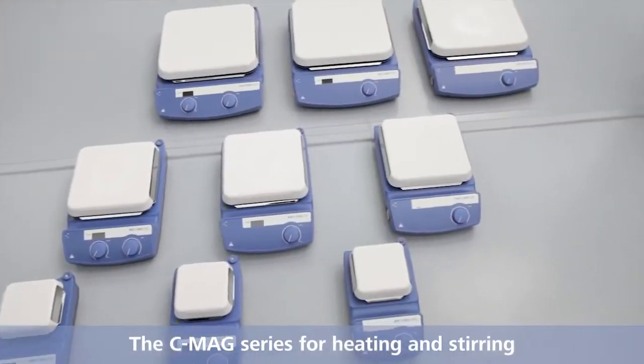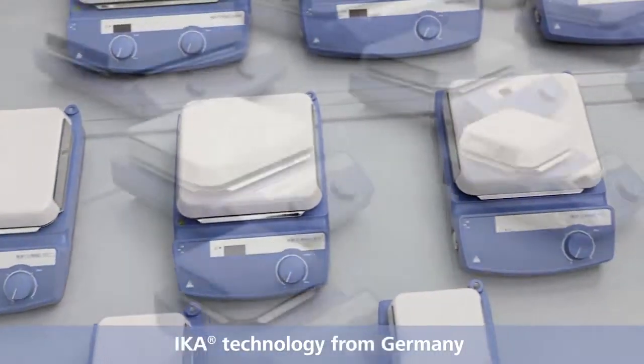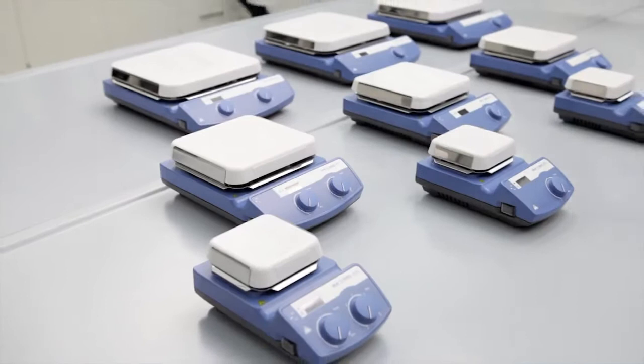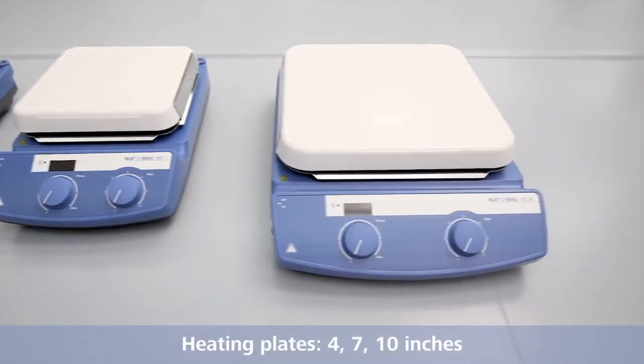The C-MAG series for heating and stirring, IKA, technology from Germany. All devices are available with heating plates of 4, 7 and 10 inches.